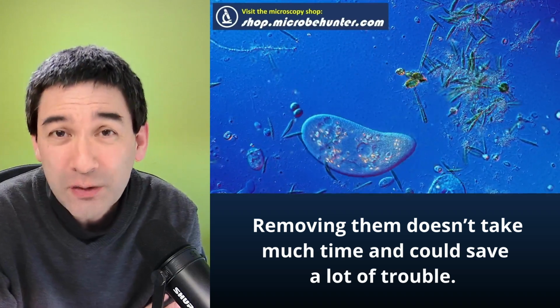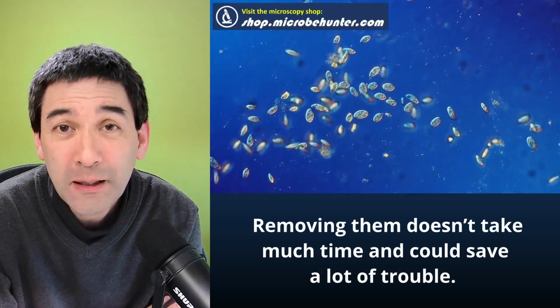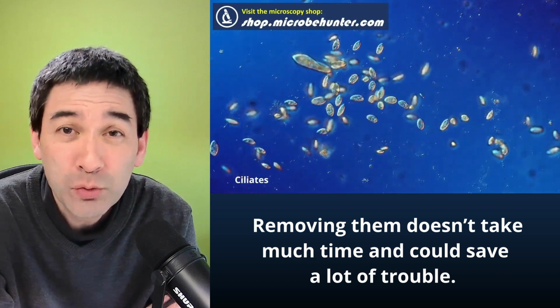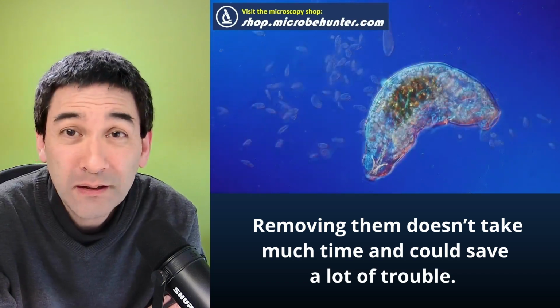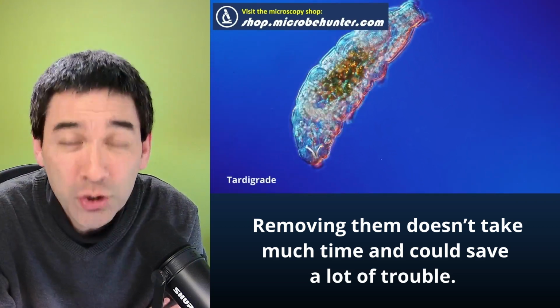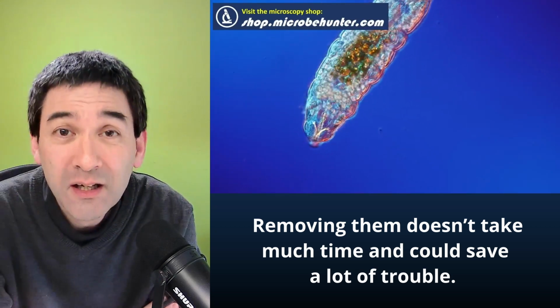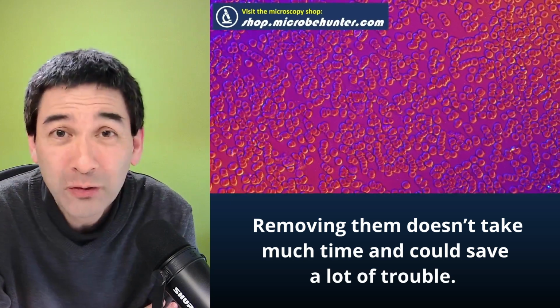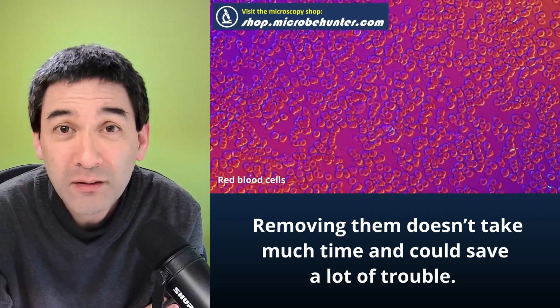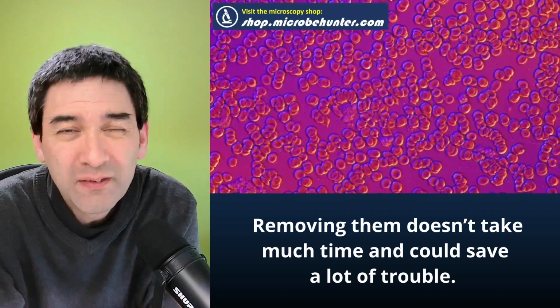However, there is always the danger that when you're changing the magnification, once there is already oil on the microscope slide, if you now use, let's say, a 40 times objective, which is a non-oil objective, this 40 times objective also becomes contaminated with oil. And this is not good, and might even damage the objective, because in many cases those objectives are not oil tight. So there is a possibility for immersion oil to actually enter the objective itself. It will find its way between the objective and the front lens of the objective, and go into the objective. And that's something you want to avoid.